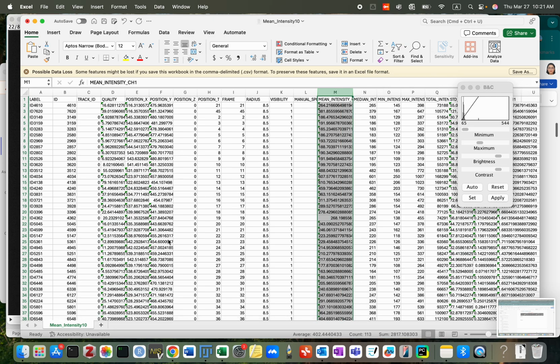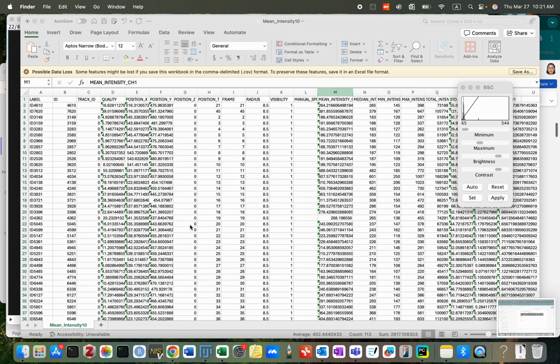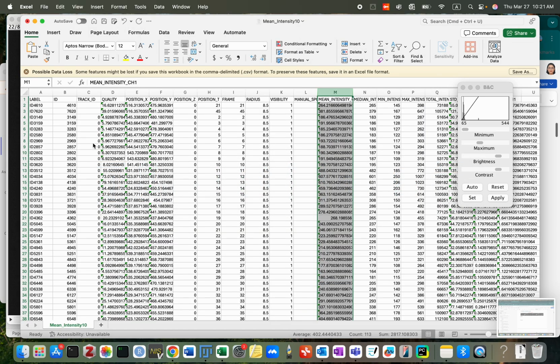Now we need to clean up this Excel to delete all the wrong selections. Come back to your ImageJ. I will check this one by one. From the top, the green circle shows these time points, the cell, what they are is here, here. Definitely those are neuron 1, so we need to delete them and come back to our Excel.